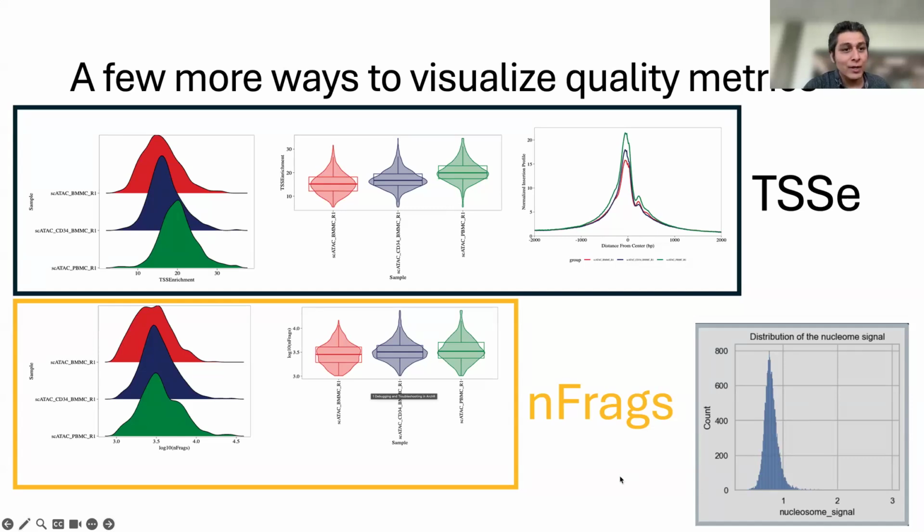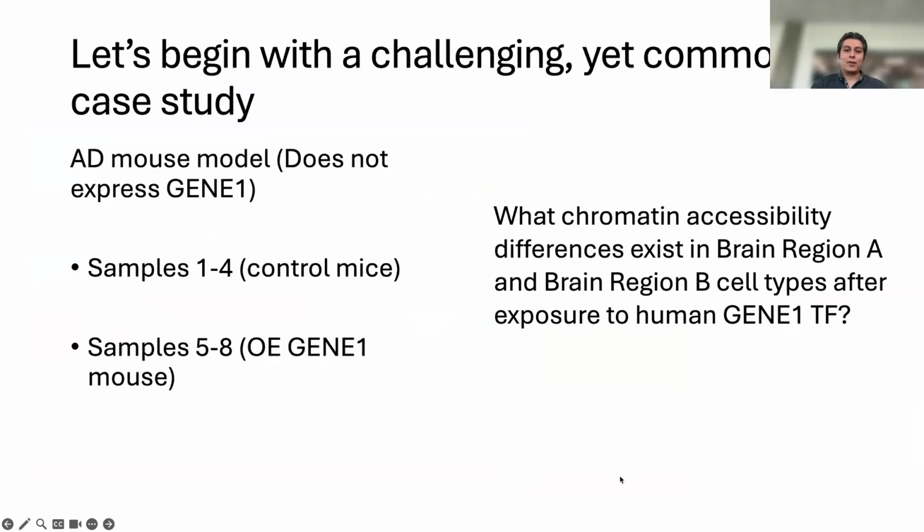Okay, moving on. Often we don't just want to query healthy cells. We're actually often interested in pathological states. Where this becomes a confounding variable is that the biology of the pathology itself can degrade your cell quality, and if that is the case, that can make the analysis process and the QC process specifically quite challenging.